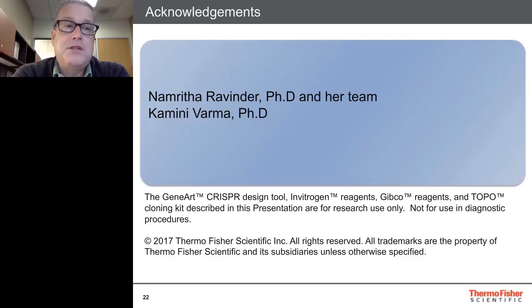That might also help change your introduction of the guide RNA into cells. If you continually have problems, you would talk to our synthetic biology group and our experts in genome editing for guidance in helping you decide what the best way is to approach your problem.